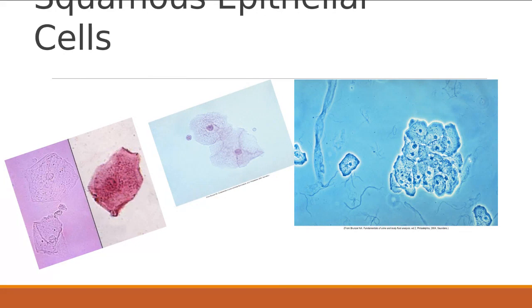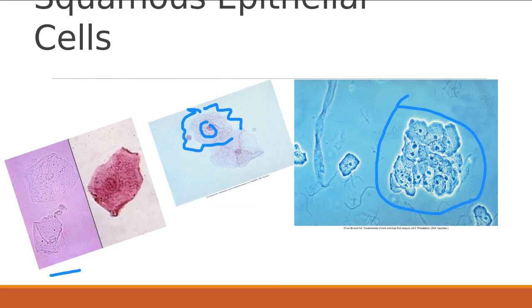They have that nice nucleus here in the middle. So here's your little nucleus, and then kind of the little fried egg edges. See what I mean? So they kind of look like fried eggs. It's the best way to explain them. And they have this large irregular cytoplasm. The edges can kind of curl or fold. So this one over here is kind of folded. They can also clump up on top of each other.